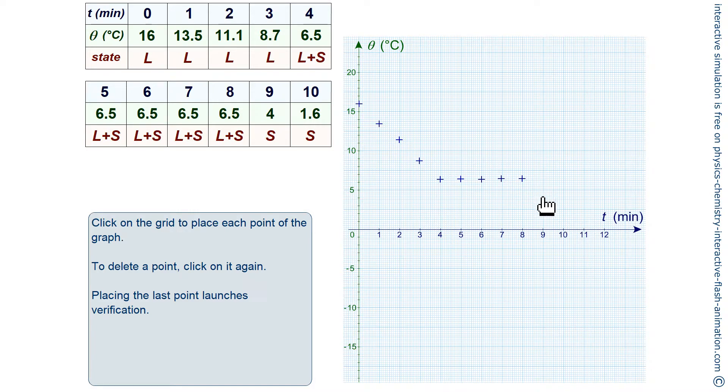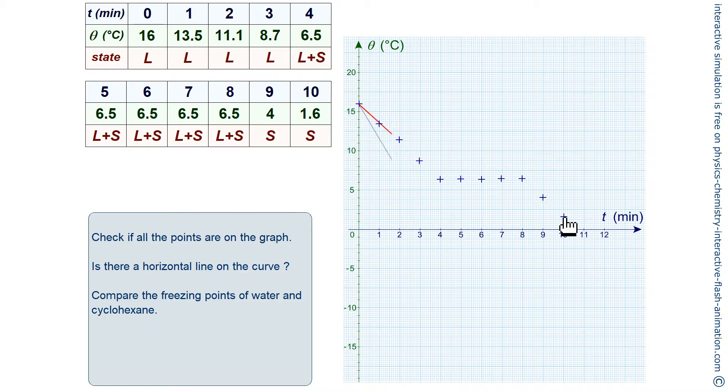Moreover, looking at the table we can already see it. The correction is displayed here. Indeed we have a horizontal line during solidification which confirms the fact that cyclohexane is a pure substance.